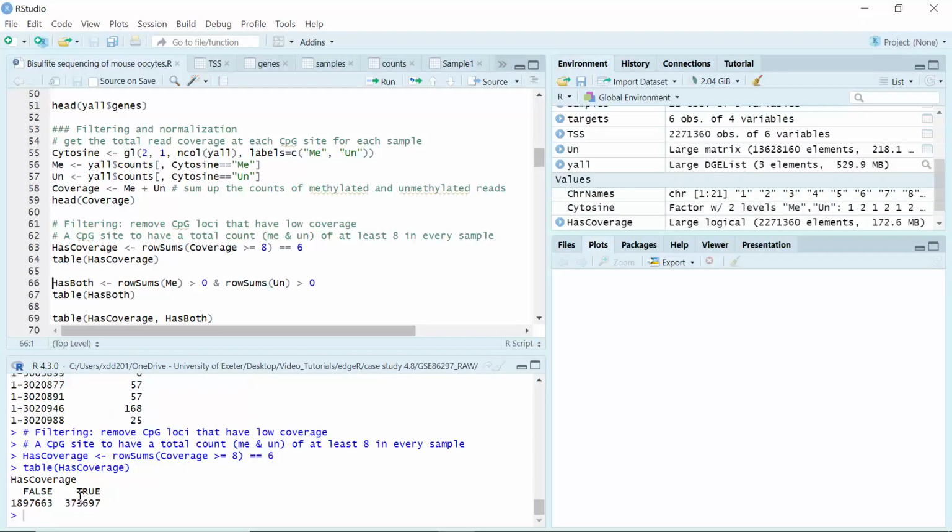Because we are going to analyze the differential methylation sites in 3 different sample sizes, 40, 50, and 60 micrometers, we can remove the cytosines in the dataset that are always methylated or never methylated, because those cytosine sites are not useful for us during the analysis to identify differentially methylated cytosines.